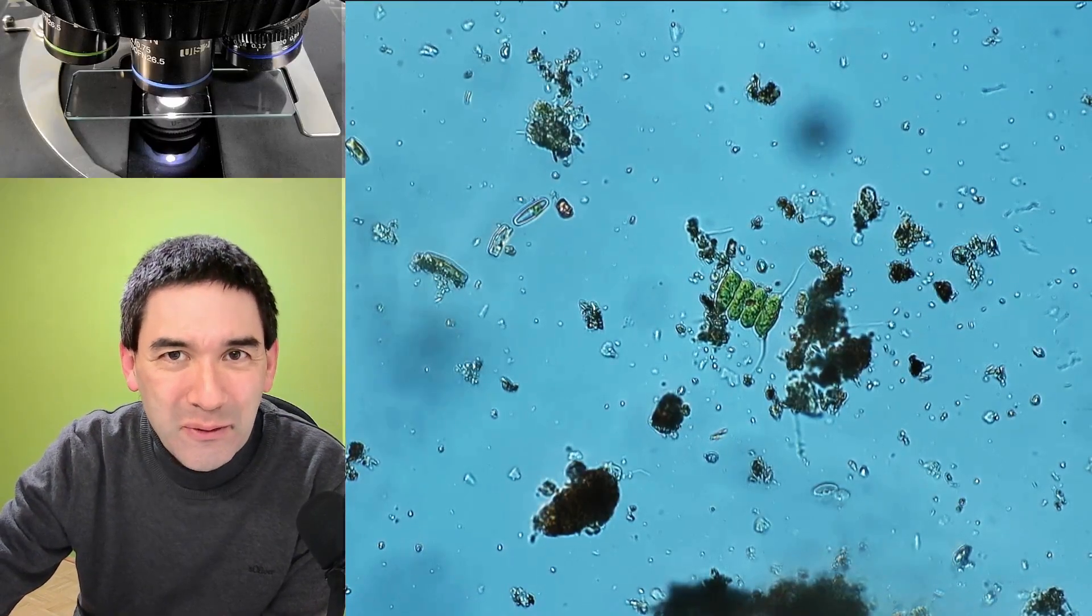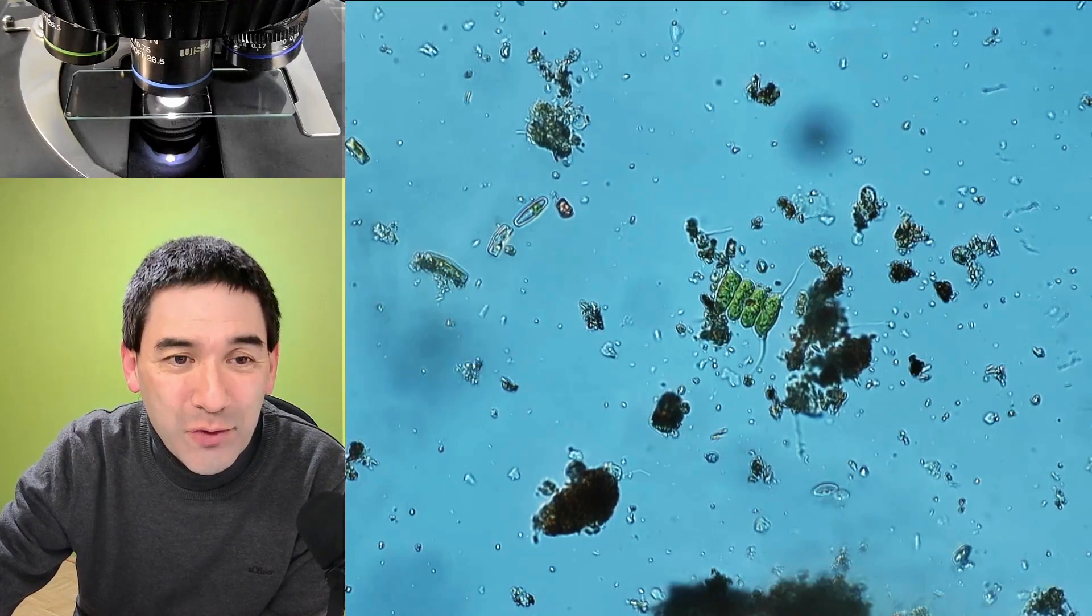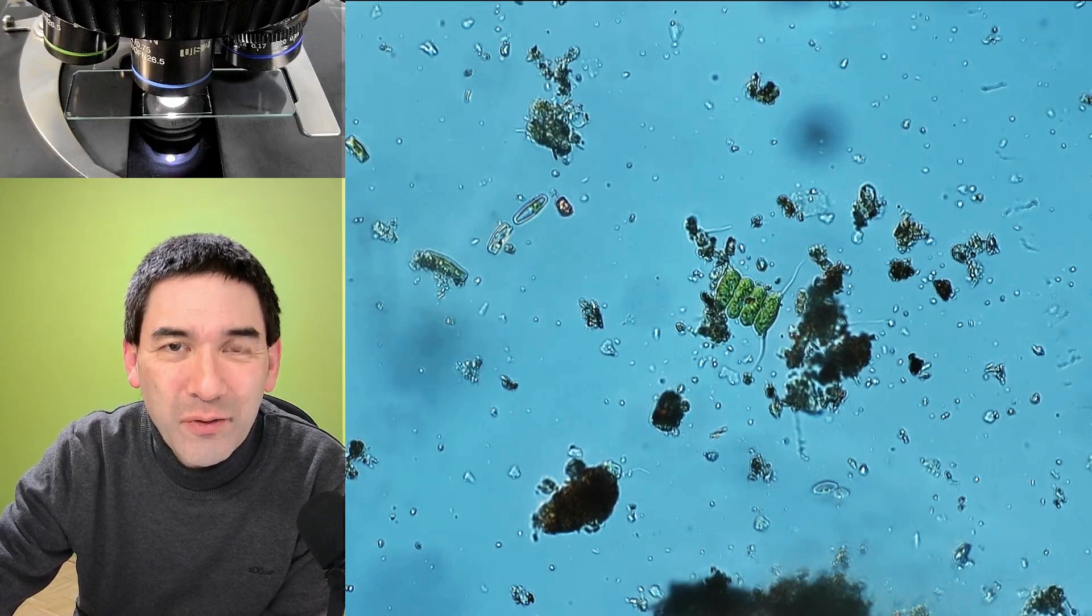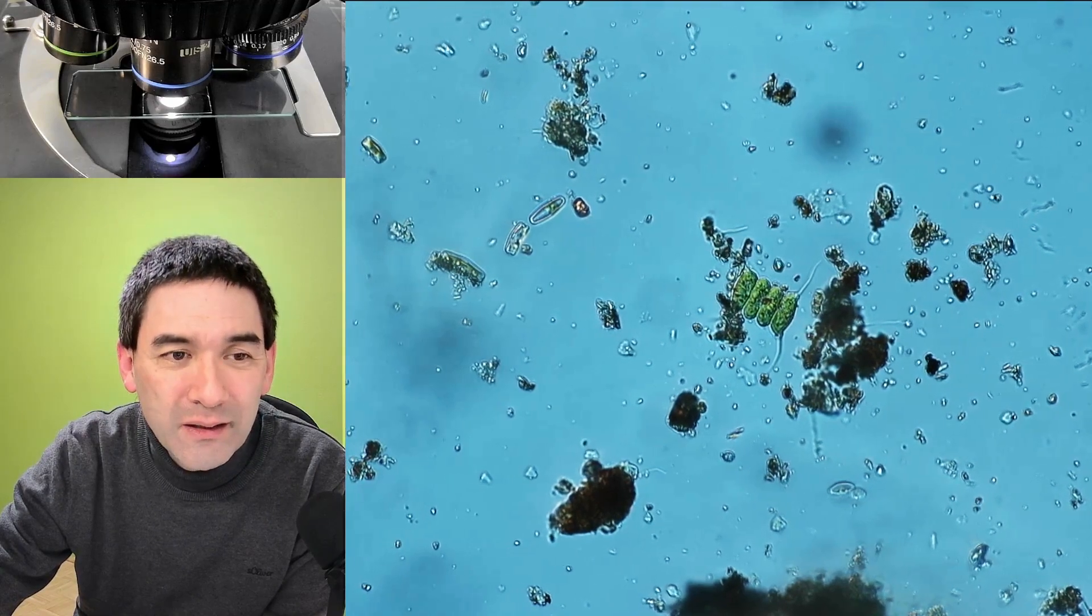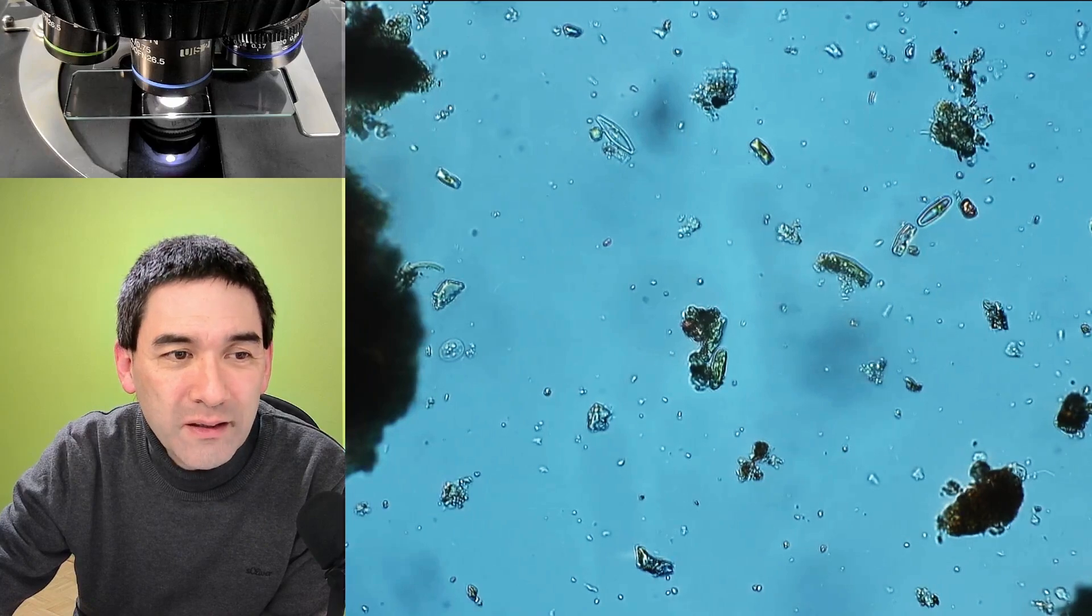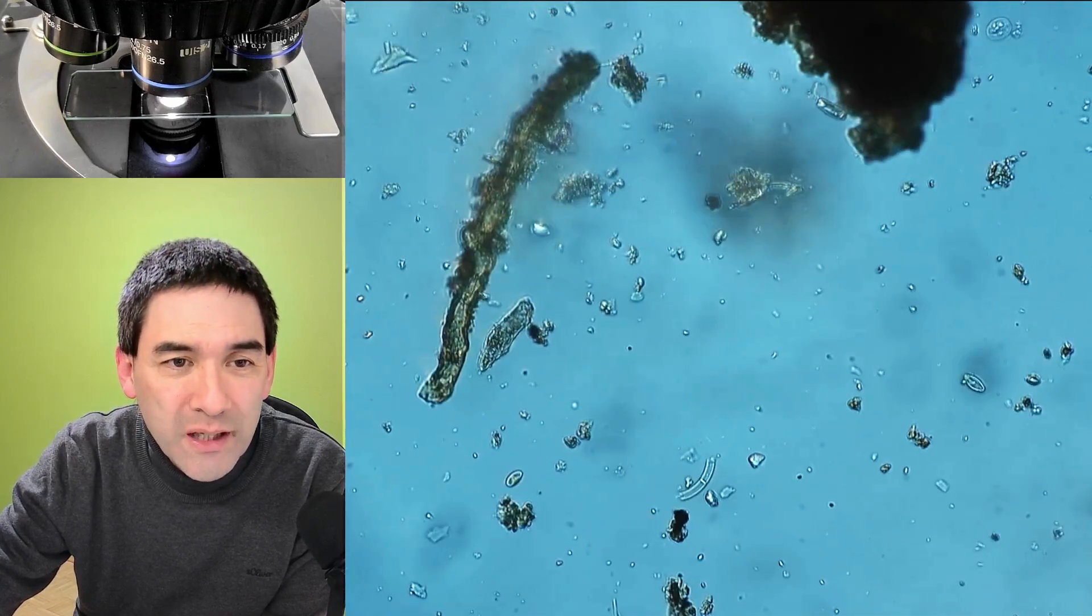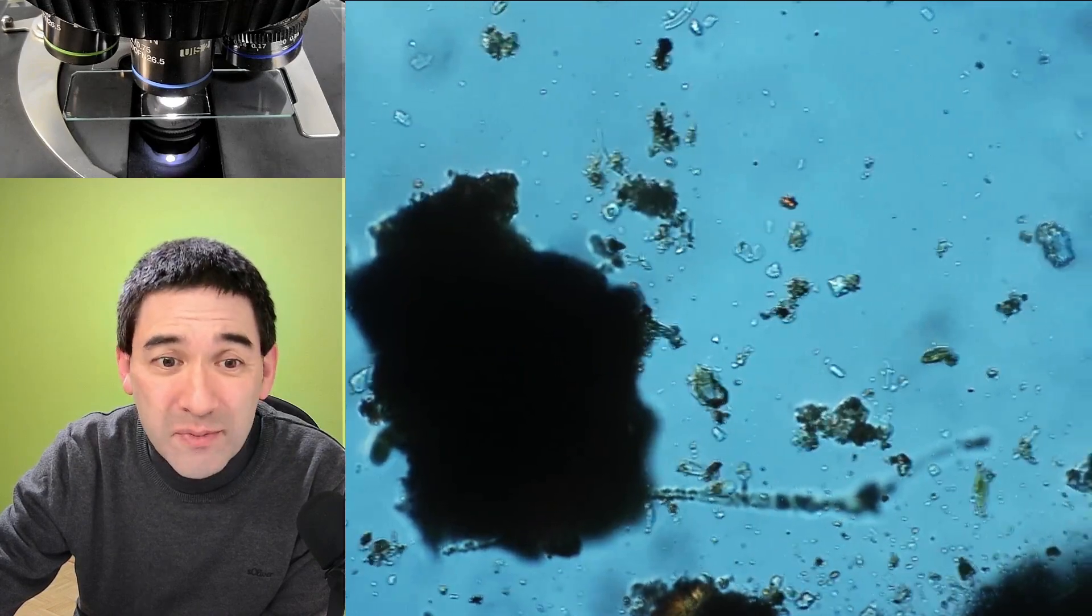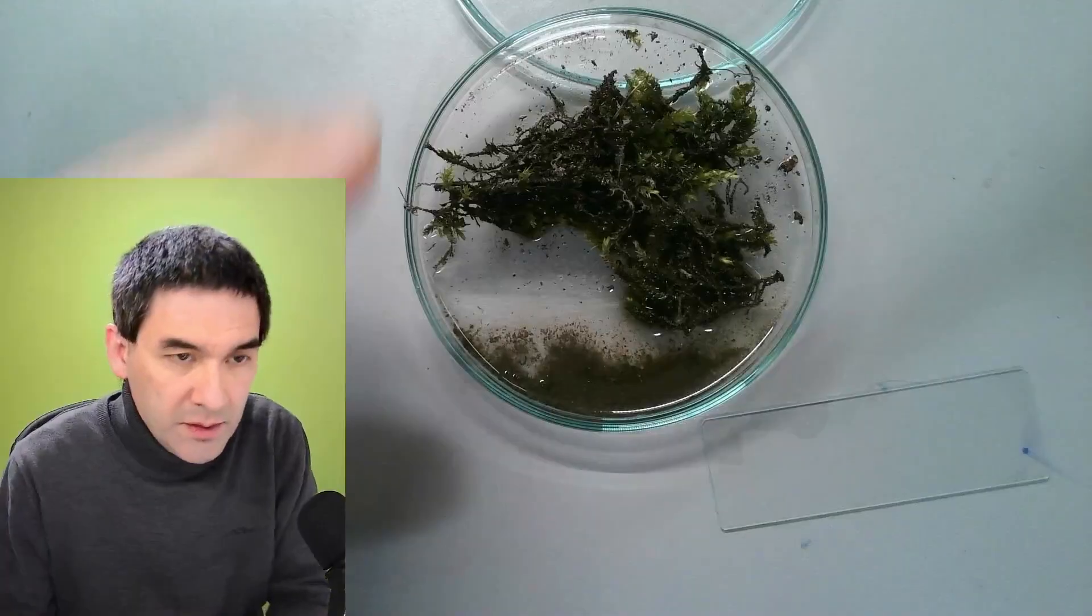I immediately put some small water sample from the moss under the microscope and look at this little friend here right in the center. Otherwise I did not find a lot of movement in here, maybe I really do have to be a bit more patient and wait until tomorrow. I'm hoping that whatever microorganisms and whatever life is in there will come back to life again.